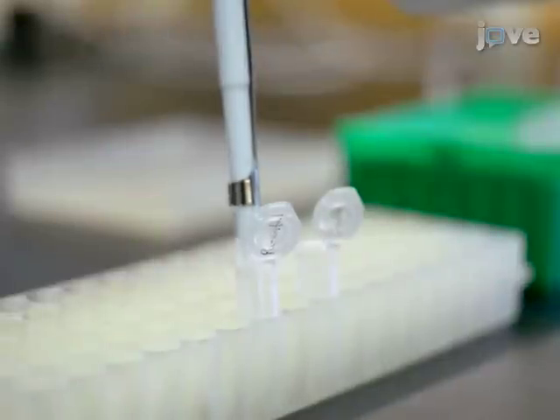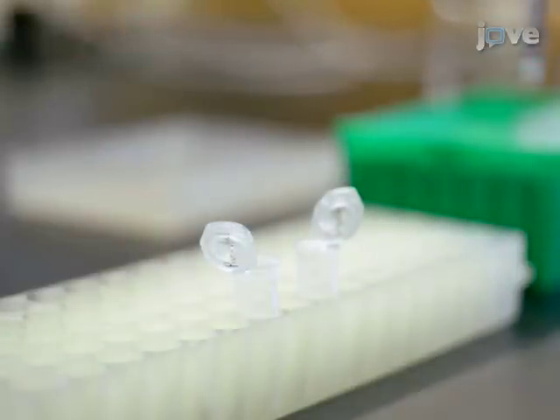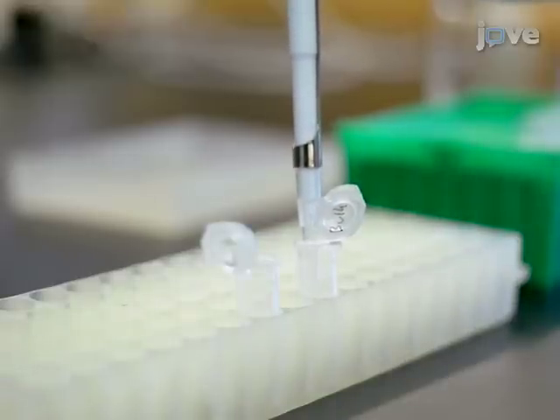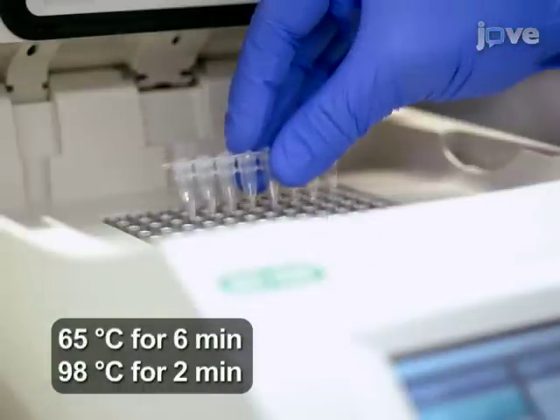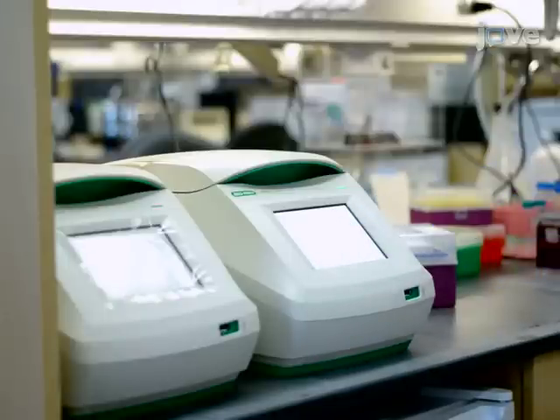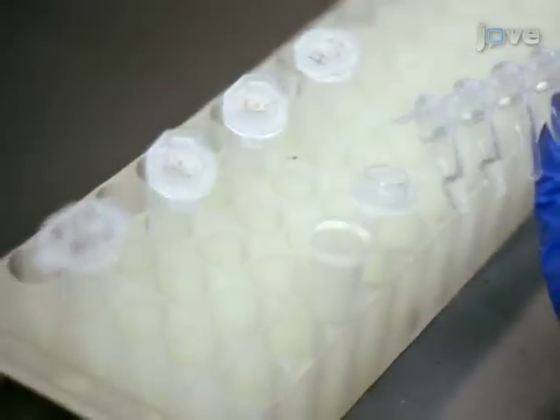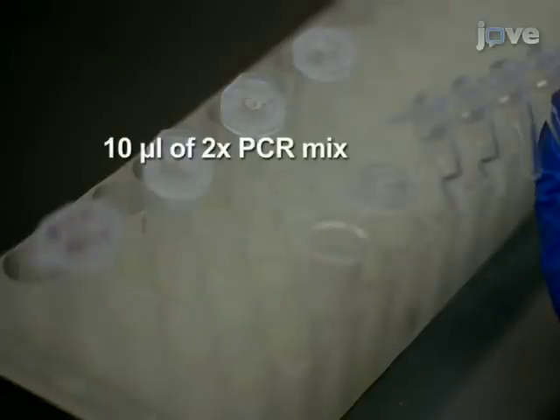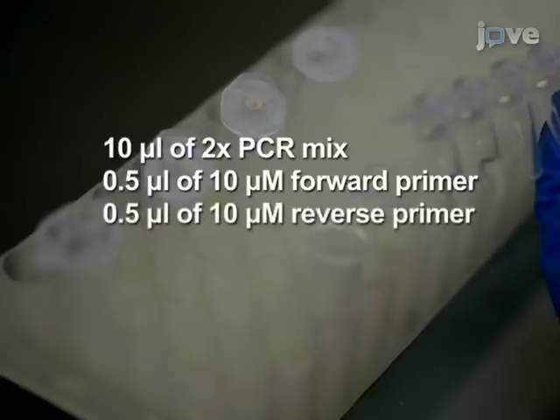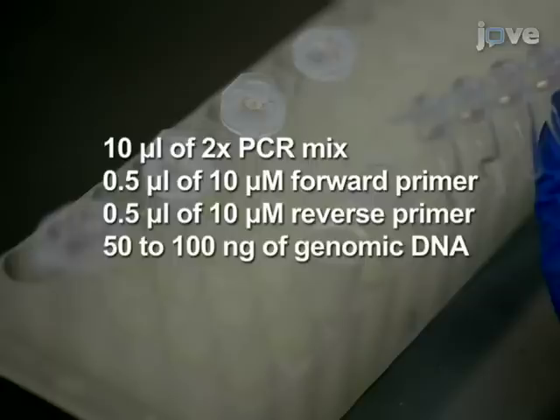To isolate genomic DNA, resuspend the parental and bulk cell pellets in 50 microliters of DNA extraction solution. Run the sample in a thermocycler to extract genomic DNA, then measure the DNA concentration. Now assemble a 20 microliter PCR reaction by combining 10 microliters of 2x PCR mix, 0.5 microliters of 10 micromolar forward primer, 0.5 microliters of 10 micromolar reverse primer, 50 to 100 nanograms of genomic DNA, and water up to 20 microliters.